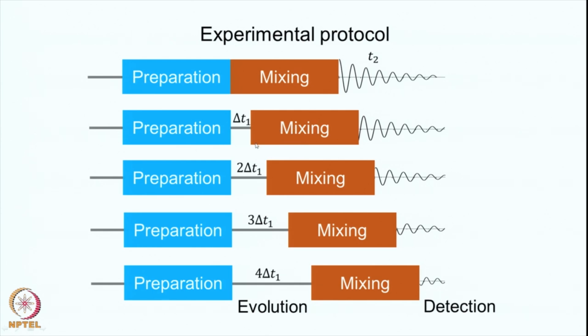The spin system transfers information from one spin to another, and then the data is collected here as a function of time. Notice the initial condition of this FID is not the same as the initial condition of this FID, and this is because of the mixing. And what has happened during the delta T1 period? The magnetization has evolved. If it is a transverse magnetization here, it evolved for a time delta T1, and then you do a mixing and you collect the data here as a function of time T2.